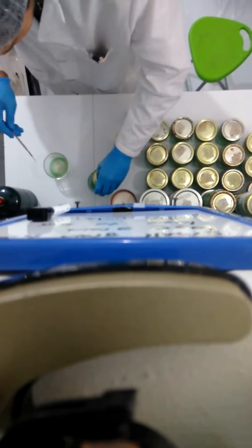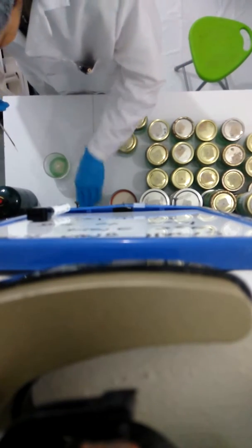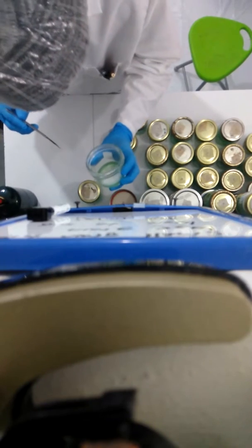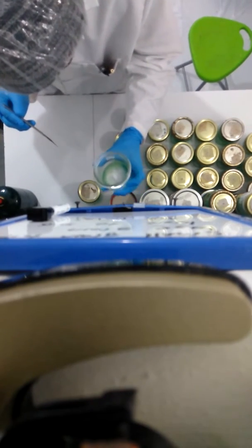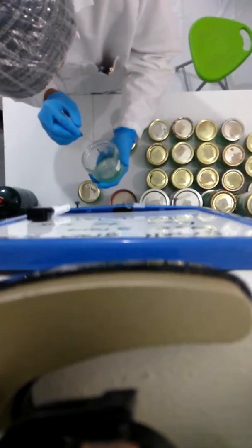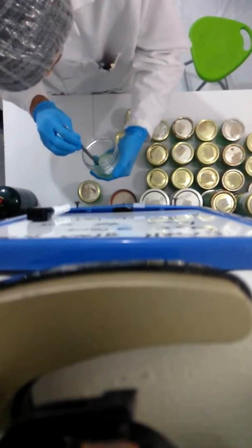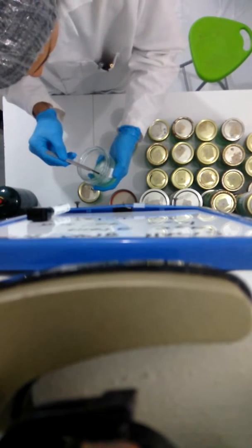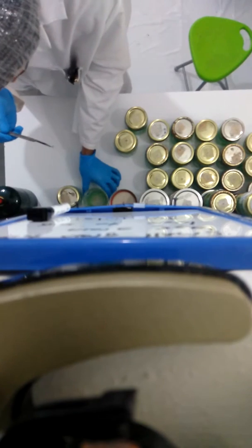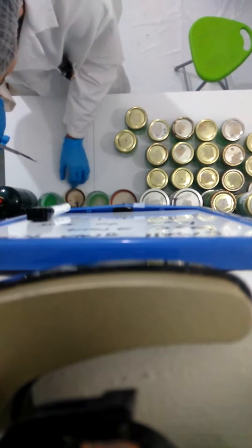I like to do this. I like to touch the agar to pull the scalpel off, on a nice smooth edge. A little triangle. Make sure you leave it in the front of the flow hood.